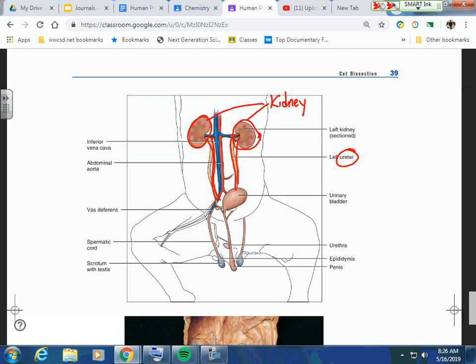And then we can even go into the chest cavity. We'll have that open up. You're going to see the lungs, very prominent, and the heart. And we're probably going to have to remove some things so that we can see the different tubes, the food tube and the air tube, which are the esophagus and the trachea respectively. All right, well, let's start with the stuff I just showed you on the video so we have something to do.